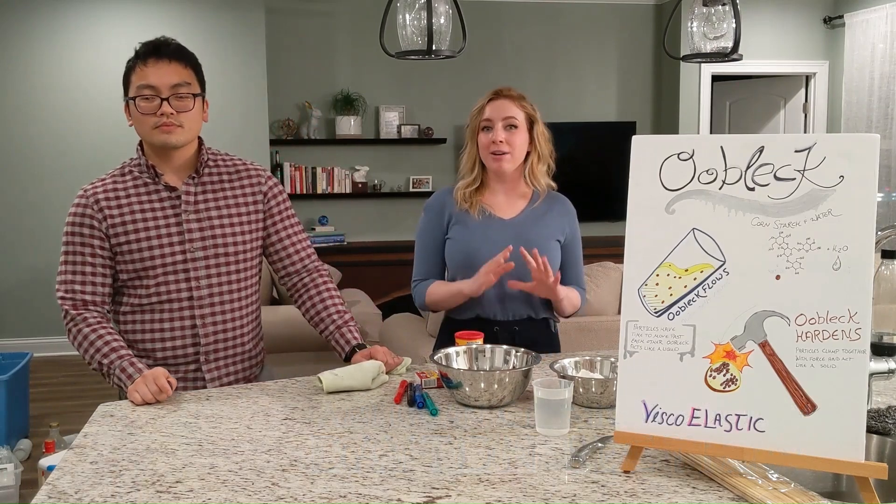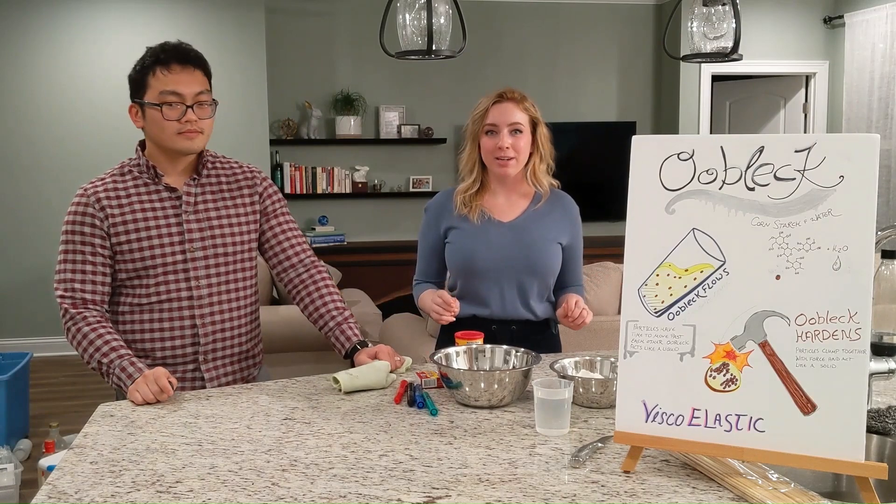Through these experiments, you'll learn about viscoelasticity, an important material property of polymers.